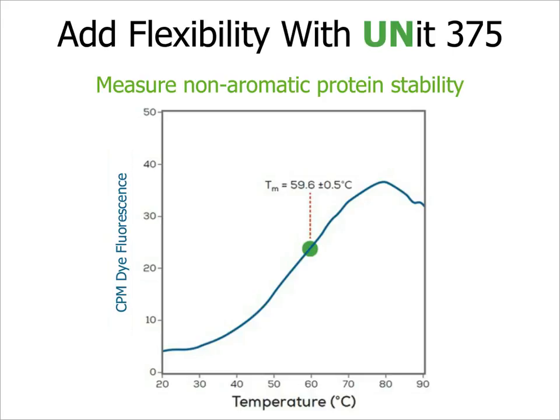It may be that the tryptophan in the protein is encased within the membrane, so when the protein unfolds, the environment does not change. It may also be that the proteins are in solution rather than in a membrane, but are stabilized by the presence of surfactants at high concentration. Traditional dyes such as SYPRO Orange, which interact with hydrophobic regions of proteins, will interact with the surfactants as well, and will give a high baseline signal, making it very difficult to obtain an unfolding characteristic.